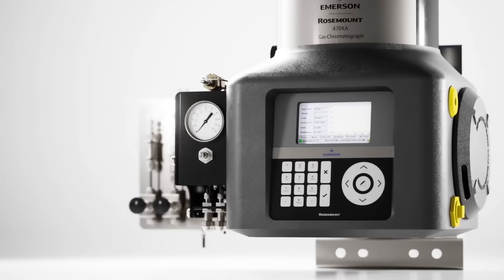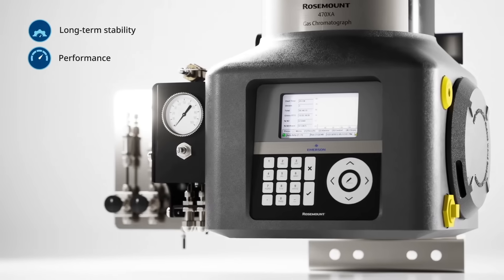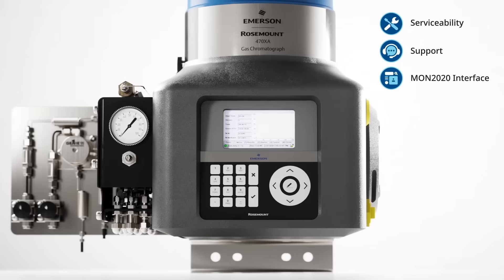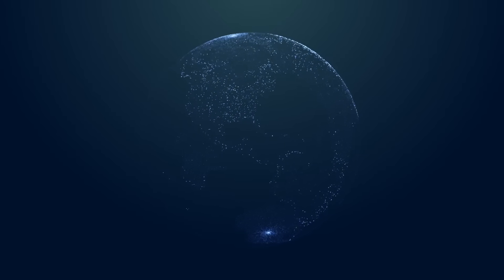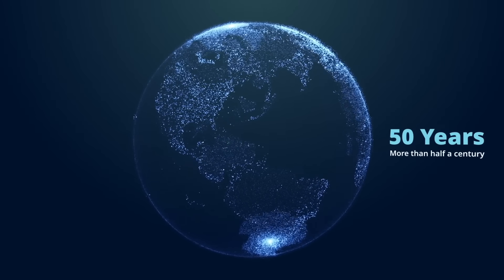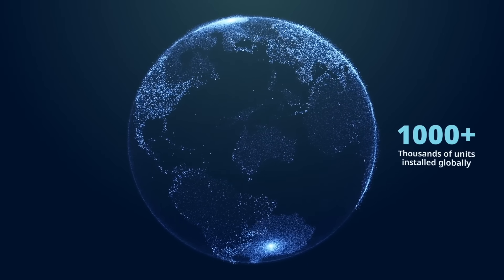The Rosemount 470 XA delivers long-term stability and expected performance, with the serviceability, support, and MON 2020 interface of the XA series product line. As an industry leader in the natural gas space, Emerson has more than half a century's experience designing and manufacturing gas chromatographs, and thousands of units installed globally.